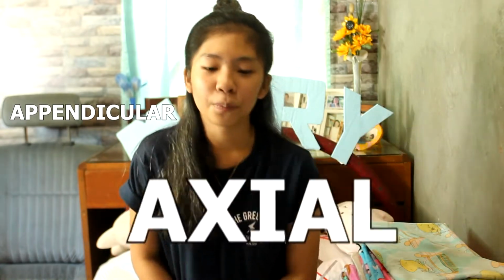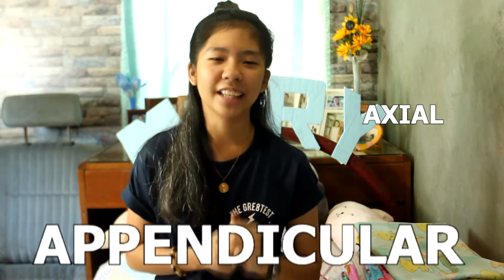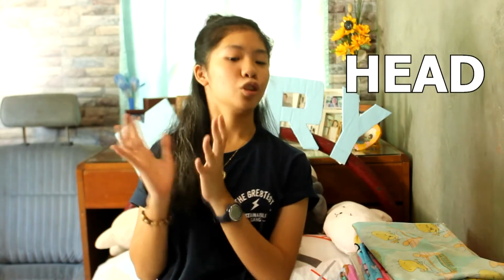Okay, so now let's go to the frogs and toads. Frogs and toads can be divided into two regions of the body, the axial and the appendicular region. The axial region is composed of the head and the trunk, while the appendicular region is composed of the forelimbs and the hind limbs. First, let's go to the axial region, which is divided into the head and the trunk.